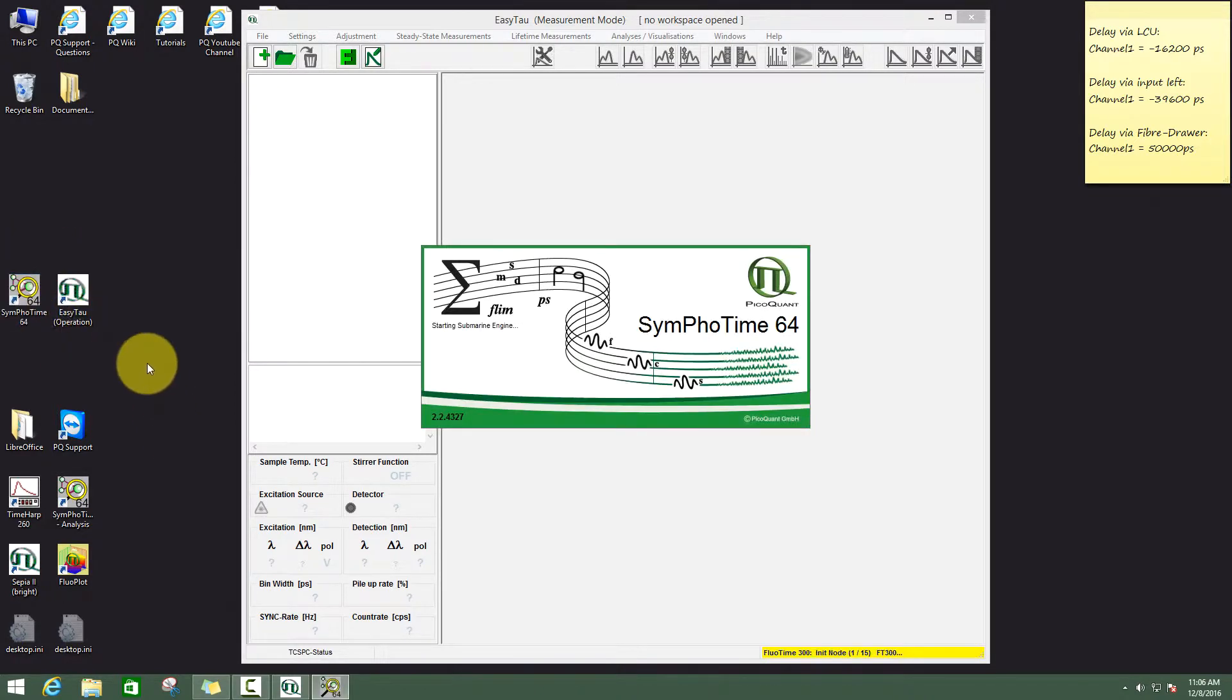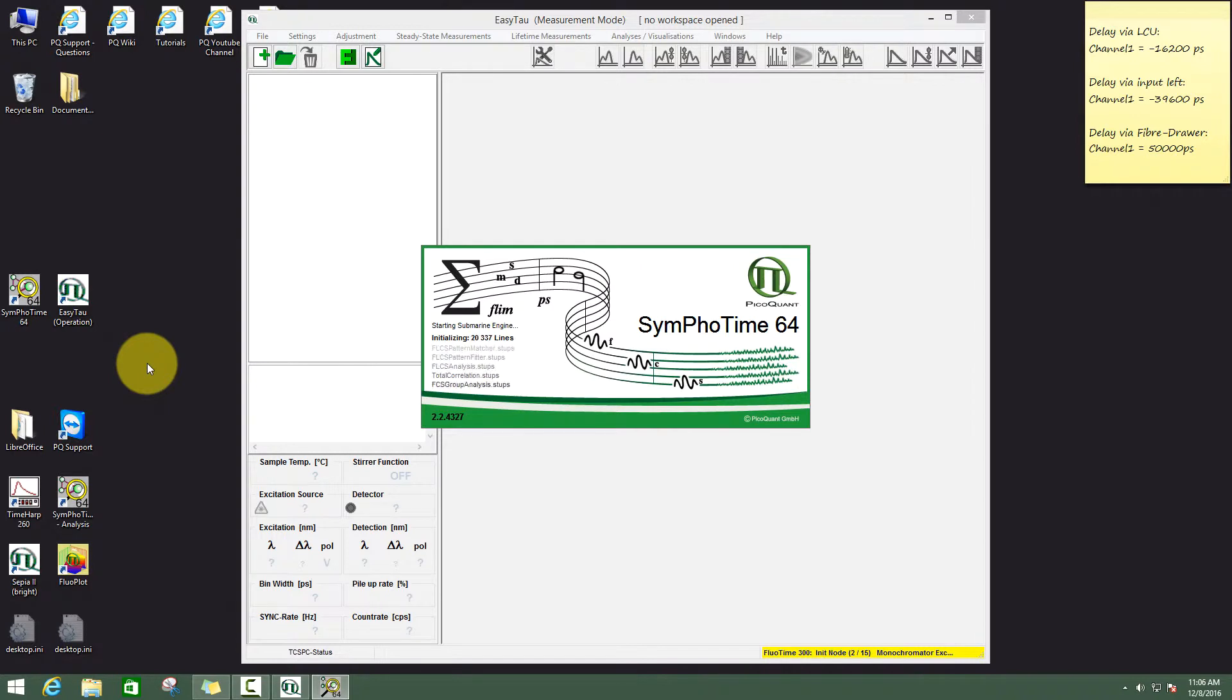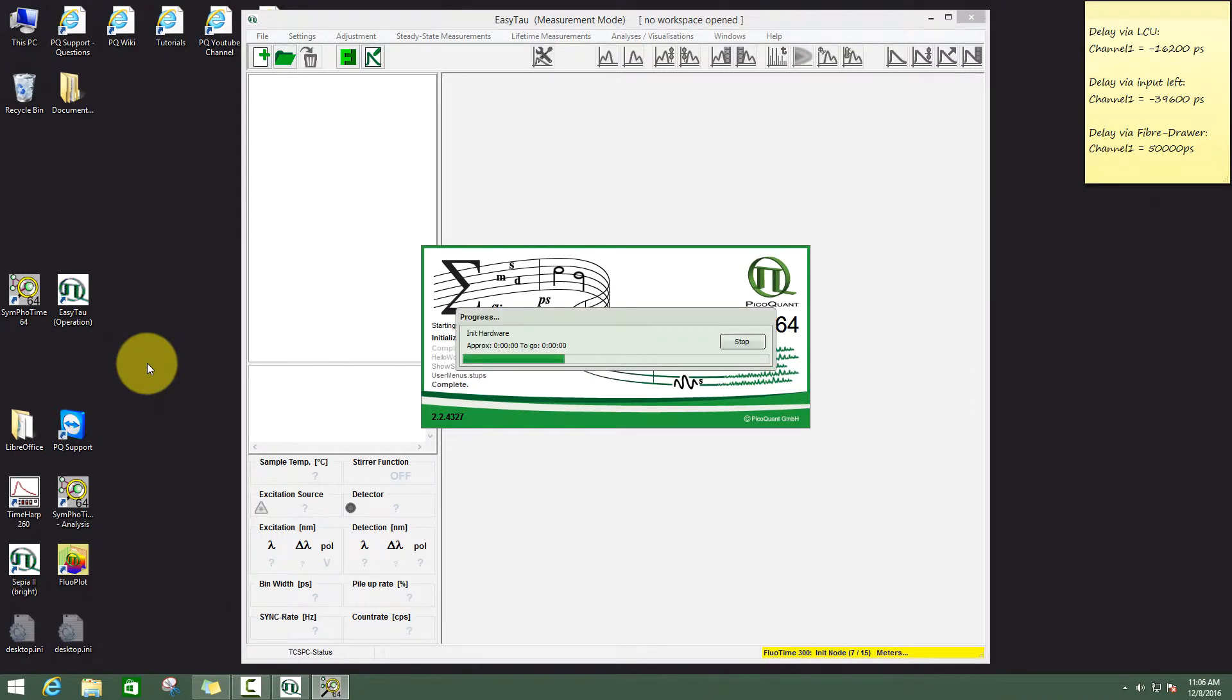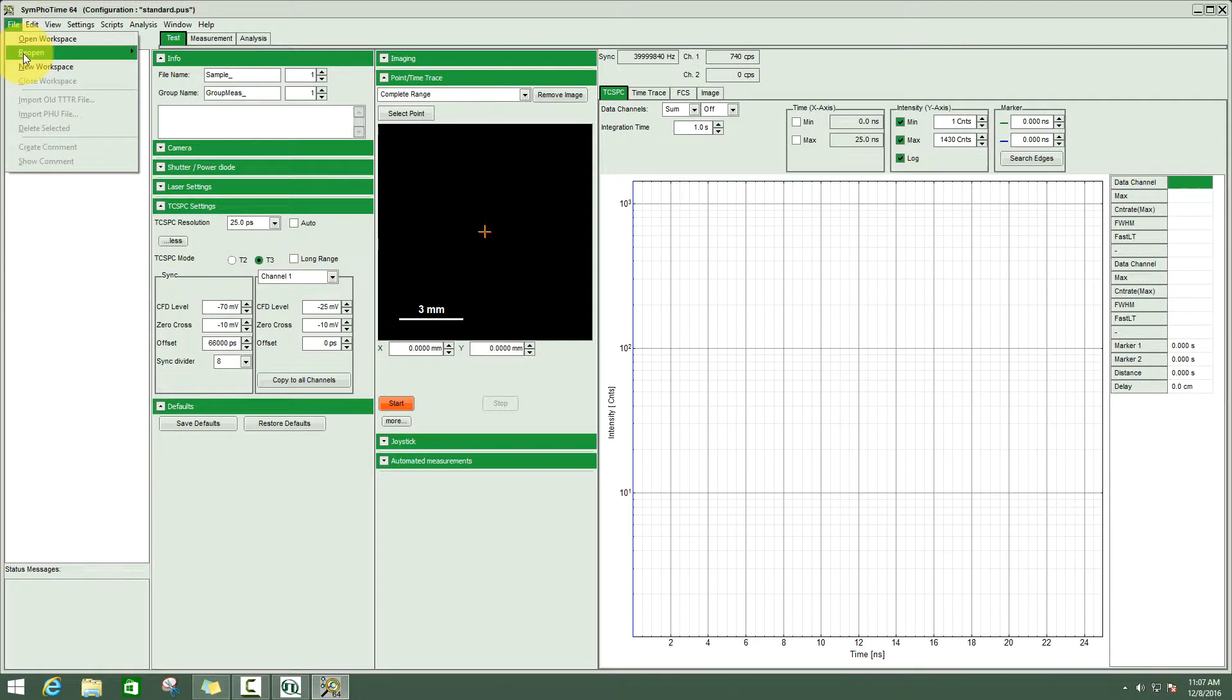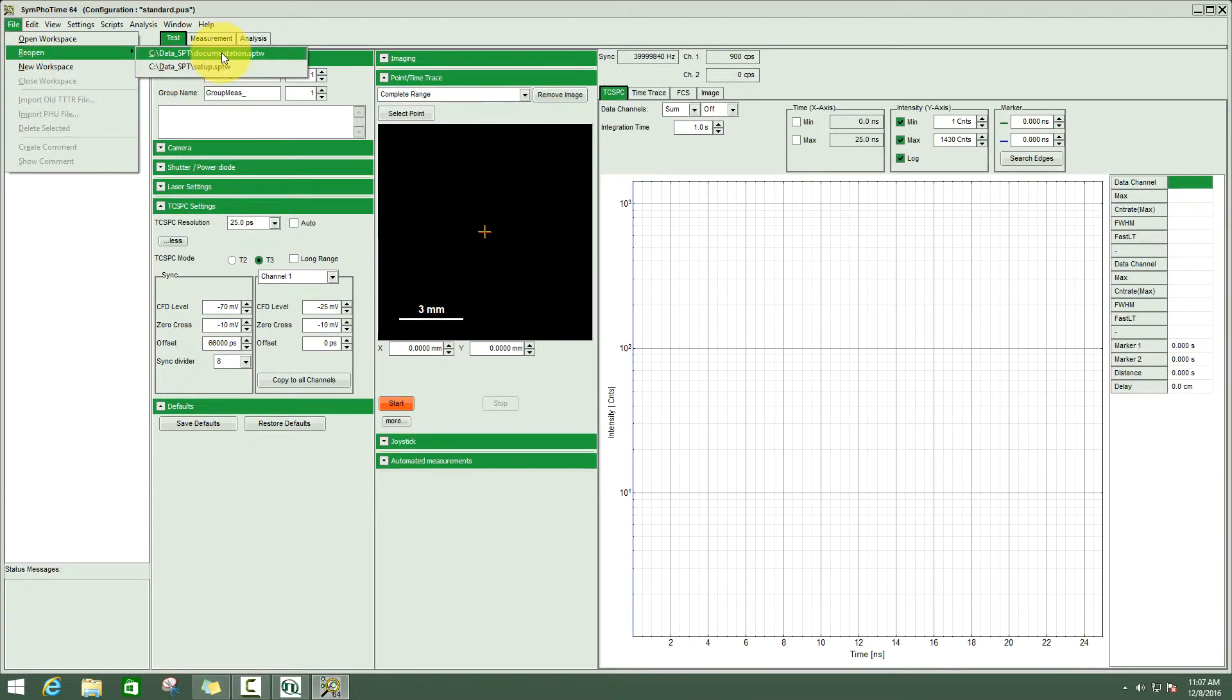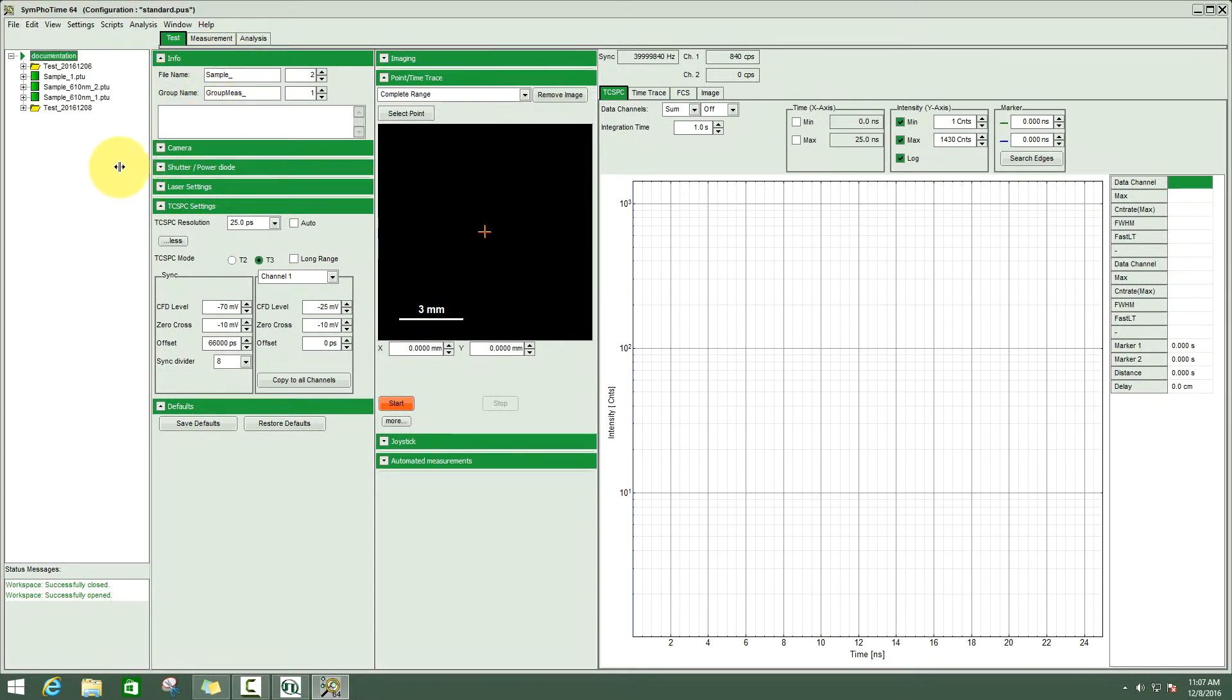When we start the SymfoTime software, it is important that all the hardware is actually switched on, especially the scanner. The hardware is initialized for the FluTime as well as for the SymfoTime. Then we have to create first a workspace or to open one so the software knows where to store the data.